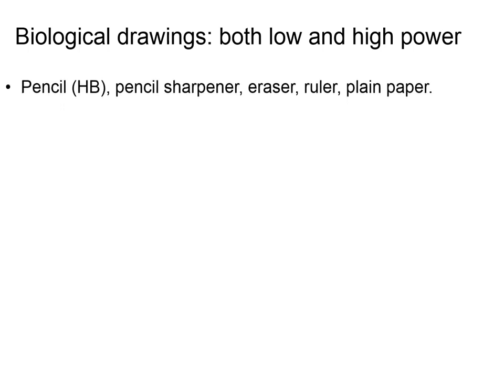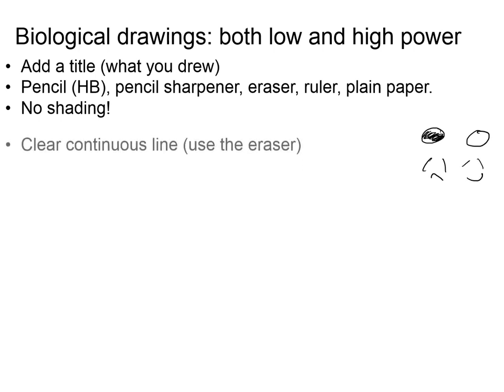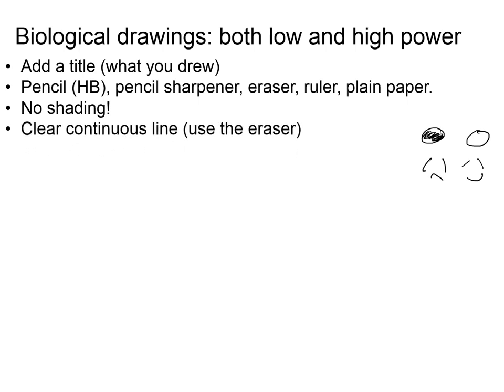Biological drawings — both low and high power. Here is how you do drawings: use a pencil so you can erase. You need to have a title for what you drew. No shading — don't draw the nucleus and shade it in. That's bad; this is good. Use clear, continuous lines. If you're drawing the nucleus and you draw it with a stray line, that's not good because we're trying to communicate very precise structures. Take your time, go slowly, and connect the lines.